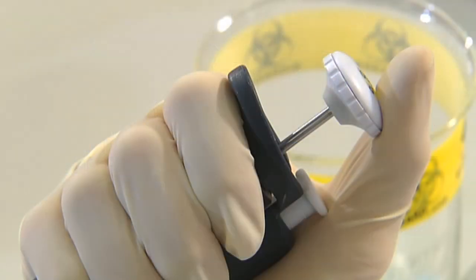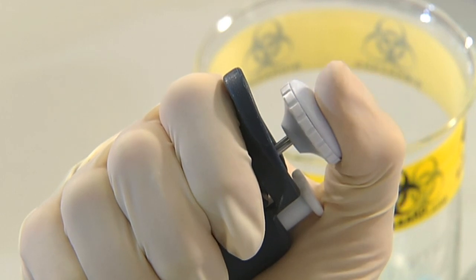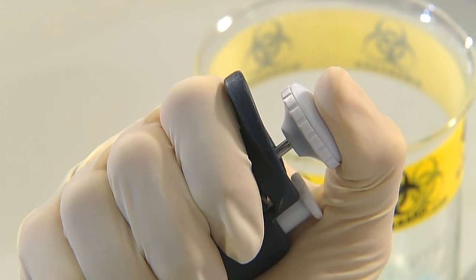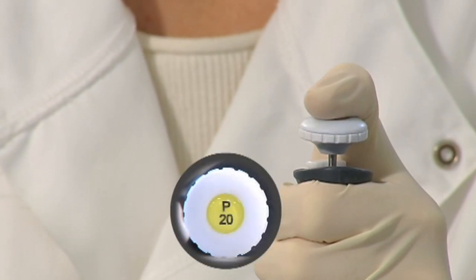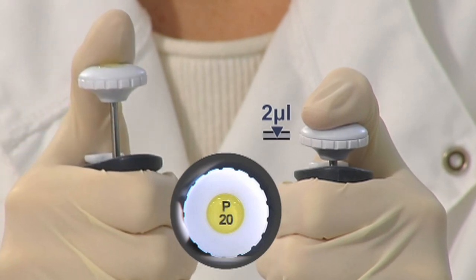Liquid is drawn in and expelled using the pipette's push button. Gently apply pressure to the button with your thumb until you feel a natural stop — this is called the first stop. The distance you need to push the button down will vary depending on the volume required. A P20 set to 2 microlitres will require less push button movement than a P20 set to 20 microlitres.